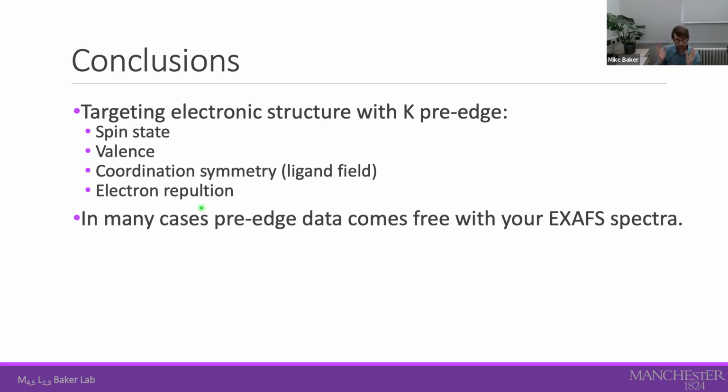So I think the big takeaway I want to provide is that in many cases, the pre-edge data comes free along with your XAFS data. So you might already have some data there where you've been neglecting your pre-edge. And I hope this talk inspires you to go and take a little more detailed look at that data to see what additional information might be there that could assist you in modeling your XAFS and having an understanding of both geometric and electronic structure.